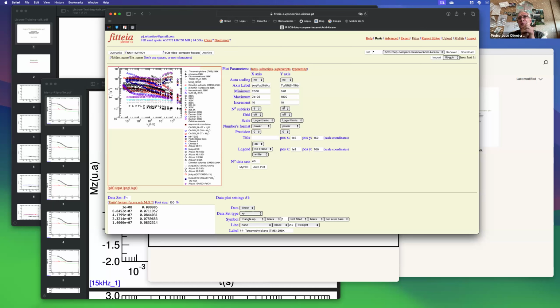Or is it a porous system where, in spite of the most mobile compound being in one particular area, it is nevertheless able to diffuse slowly to another compartment, and then you have a homogenization of T1?